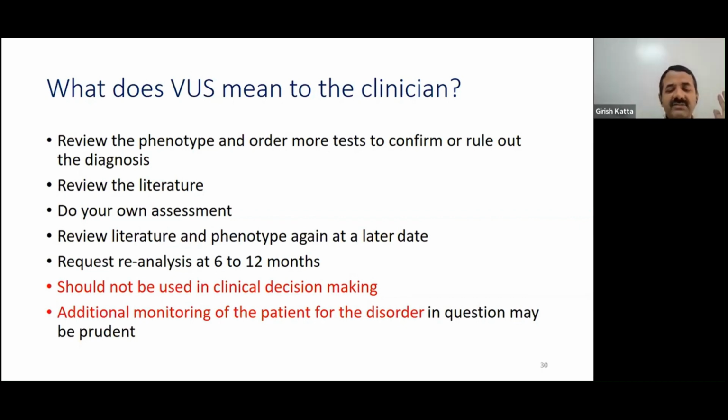Usually lower coverage is sufficient, but the only problem is you get a huge volume of data, which is very difficult to analyze. Even though we do whole genome sequencing, we often analyze only the exome or exon-intron boundaries and very few areas of our interest. We can get information on copy number variations as well as chromosomal structural abnormalities from whole genome sequencing.